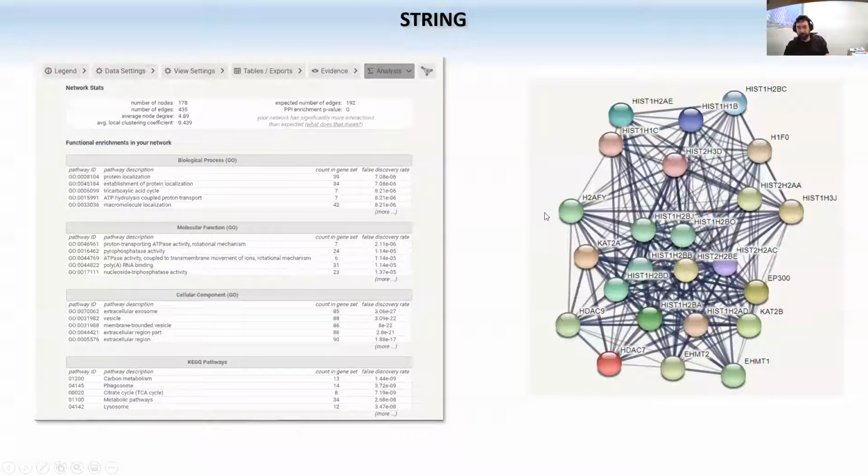And that's how you connect a list of proteins that are in your data set, that are regulated, and you want to know which ones form, for example, specific complexes. You just paste your protein list, and then you get out a network like this. Be careful to be conservative with the filters. If you paste too many proteins, you get a network of hundreds of proteins, which is hard to read. So first look at what is significant, then look at what kind of properties you want, and then input that pool of proteins, and that's what you get in the end.